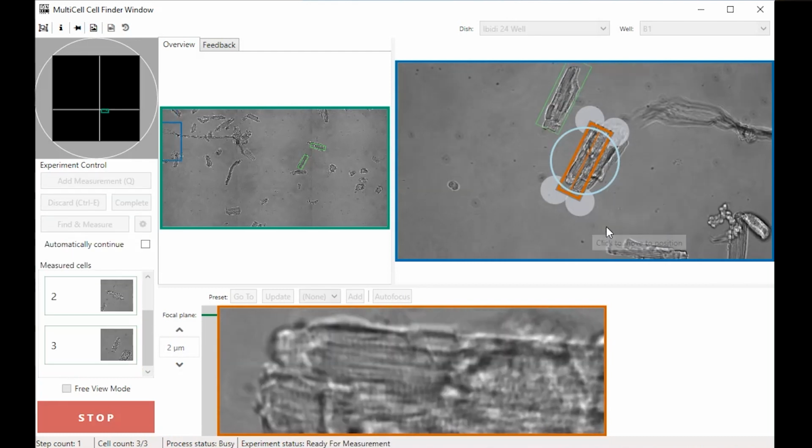So rather than make a measurement of a cell, then wash the cell away, put new cells in, and repeat, you would actually measure from 100 different cells at once.